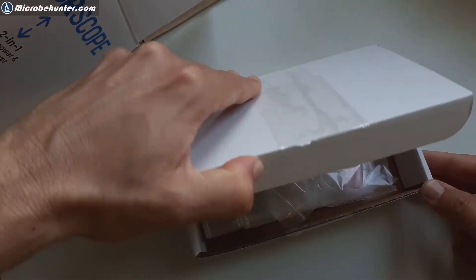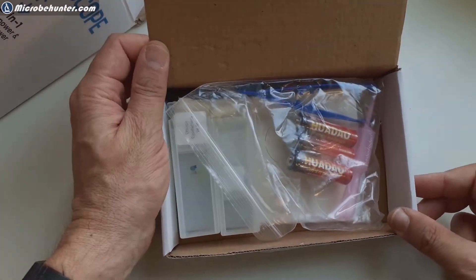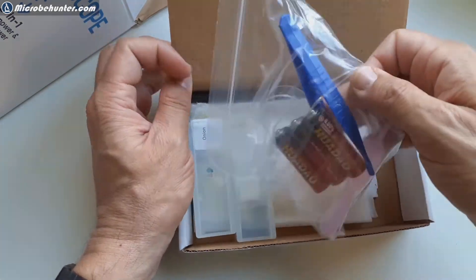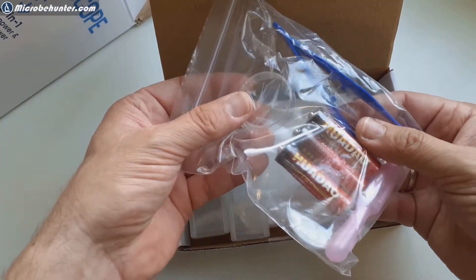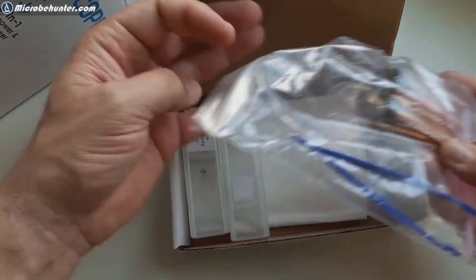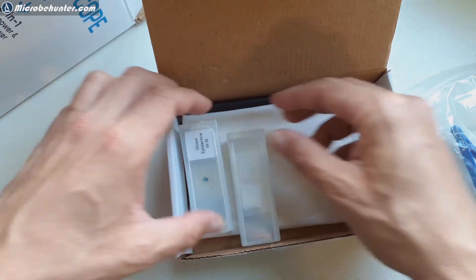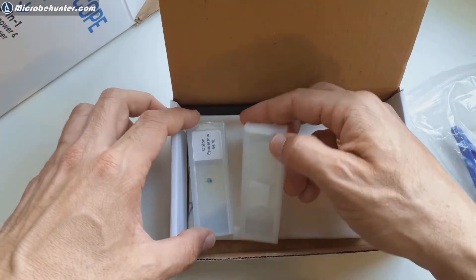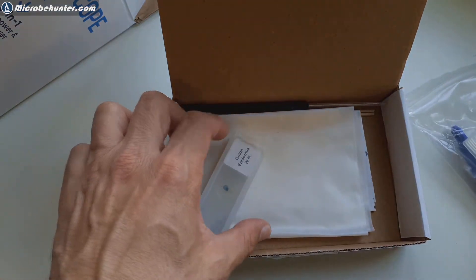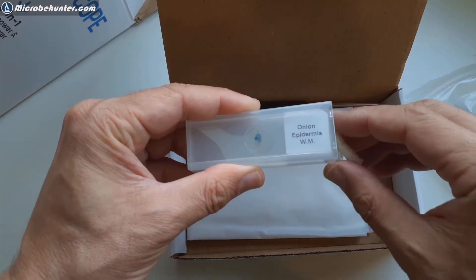Well I opened the cardboard box and yes batteries are included and there are a whole bunch of other accessories as well. Like for example the blue thing that's a tweezer, there's also a clear petri dish, a dropper pipette for water, a whole bunch of accessories and glass slides. Also quite nice it came with five glass slides and cover glasses in case you want to make your own slides and also a set of five professionally prepared slides, permanent mounts.